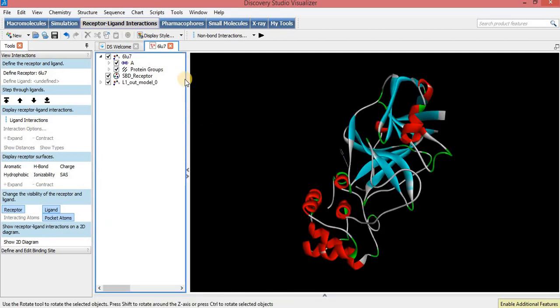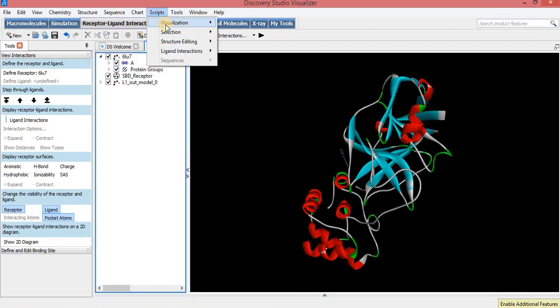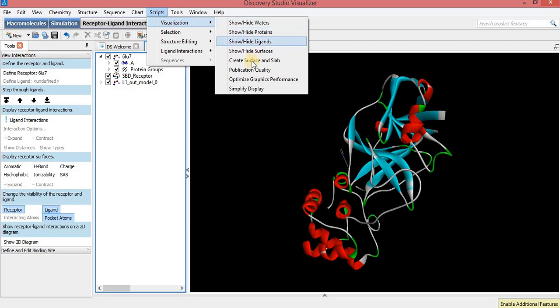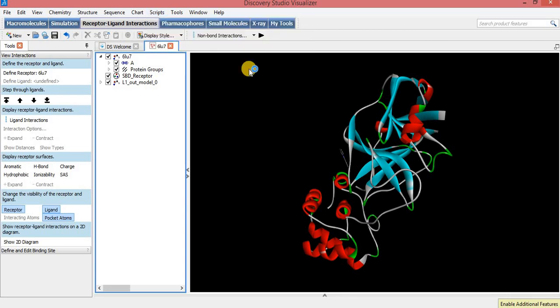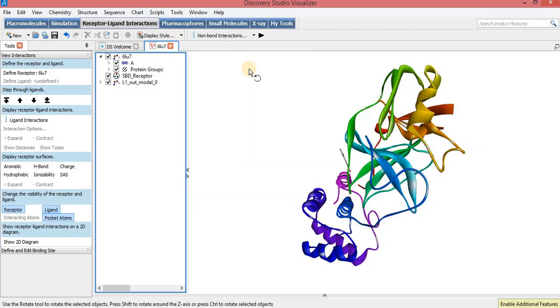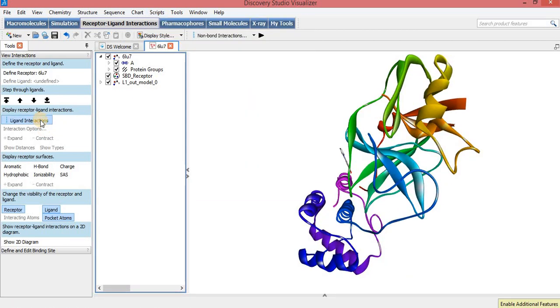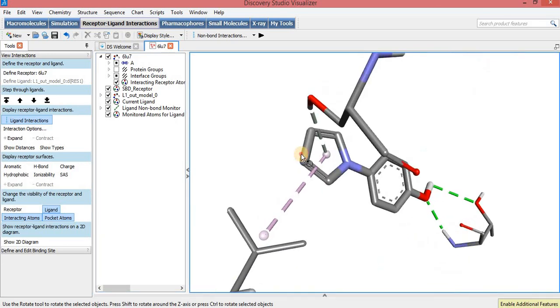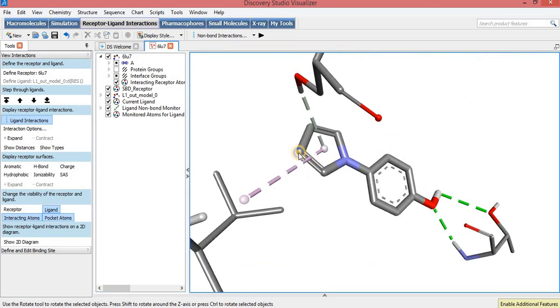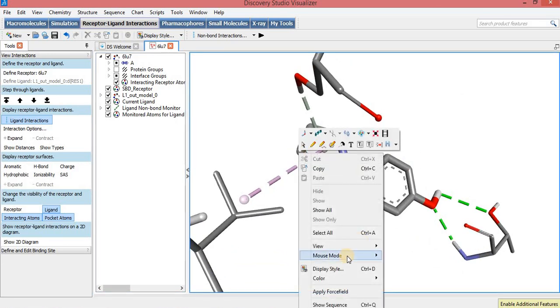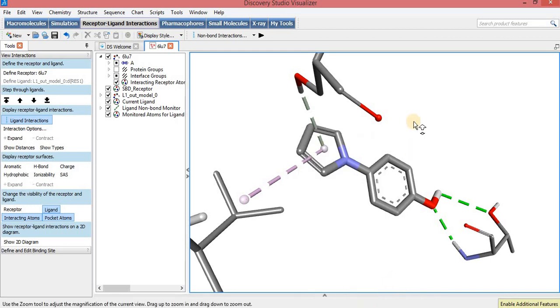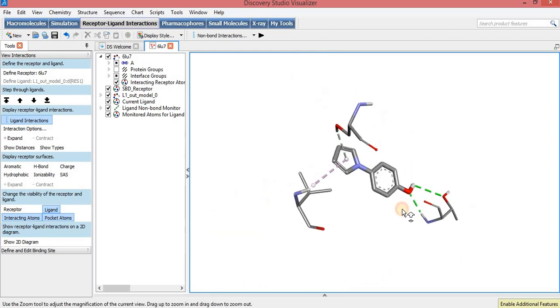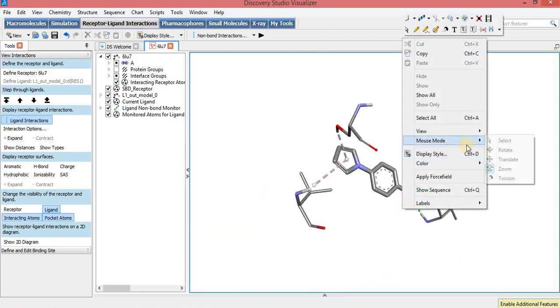To get more clear and better interactions, go to Scripts, then Visualization, then Publication Quality, and then click on Ligand Interactions. To get more attractive interactions between the ligand and protein, you can change the display style and color of the ligand.